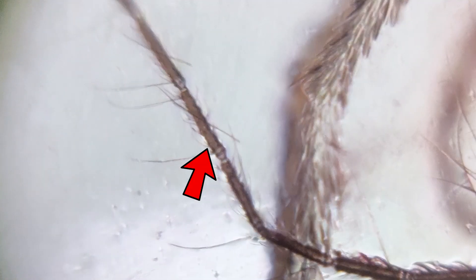After this, if you look at it, you can see the antenna on the left or right. And you can see in the center the proboscis. Maybe if I'm pronouncing it wrong, then forgive me. But this is the proboscis, which takes the blood through inside. Basically, this is the part that punctures our skin.